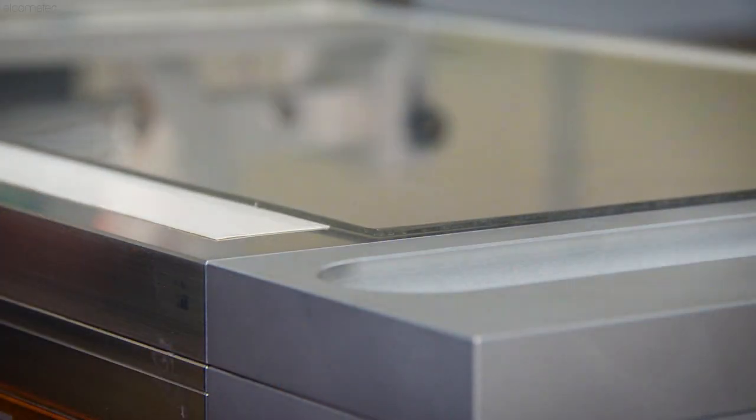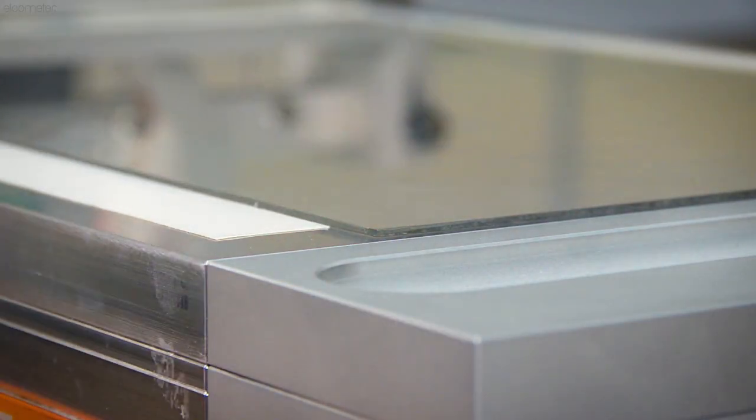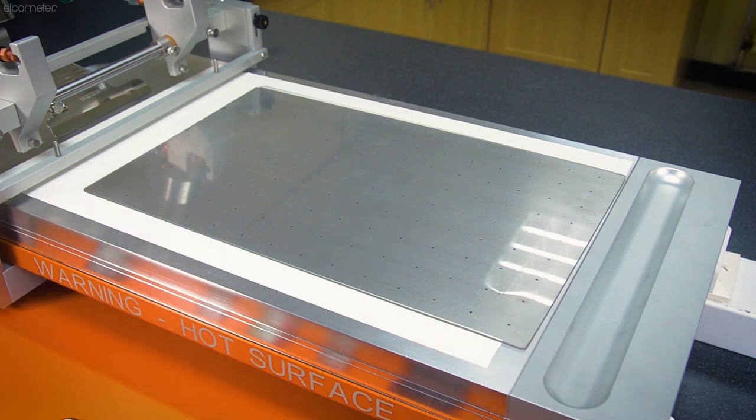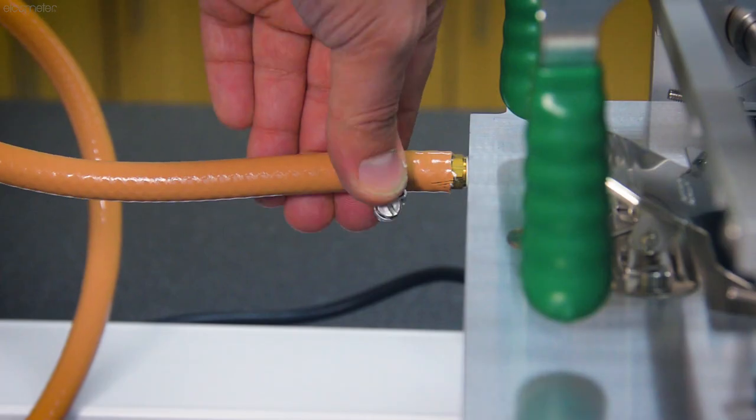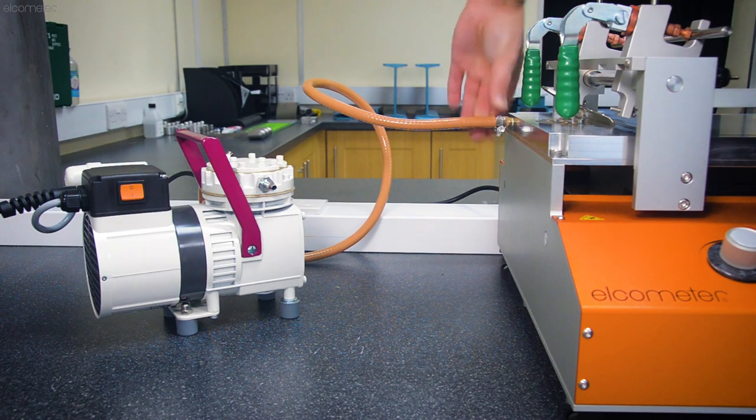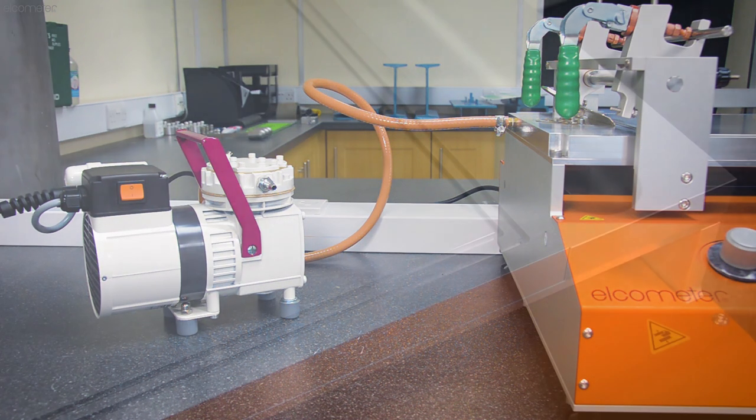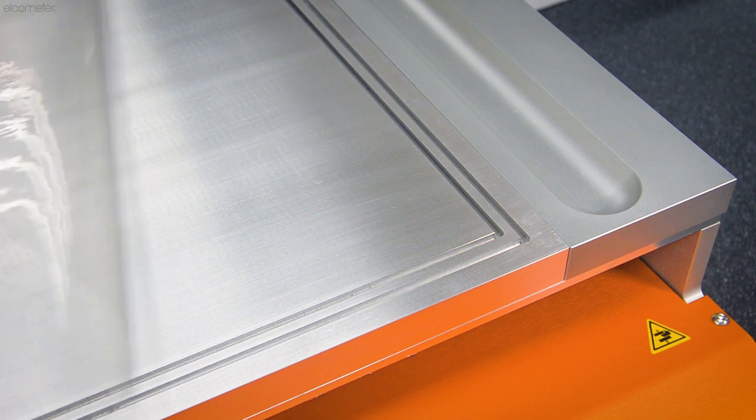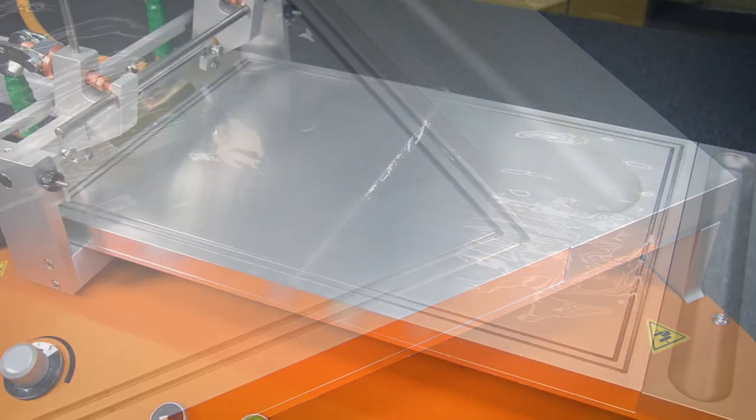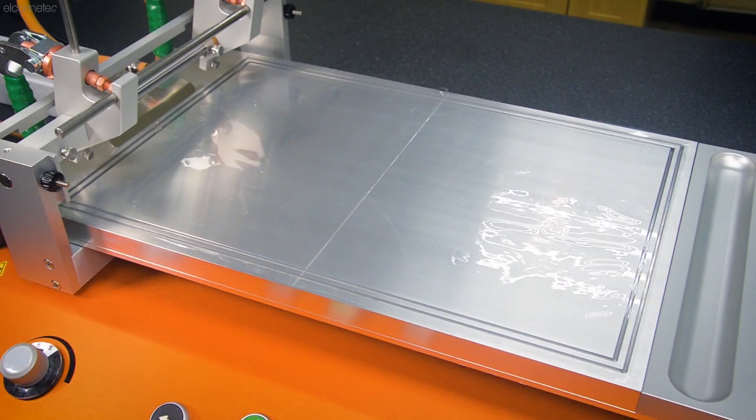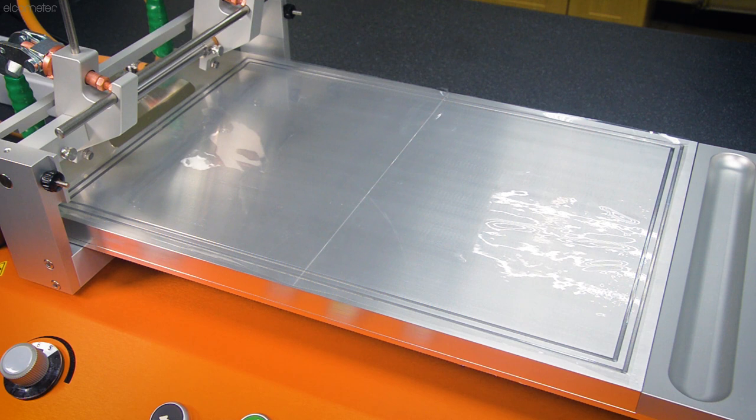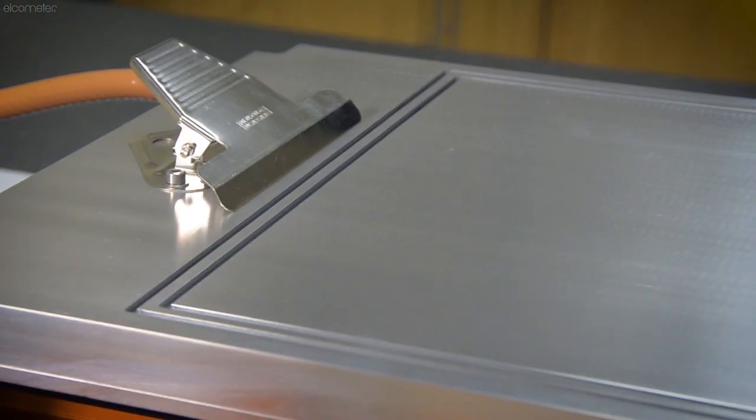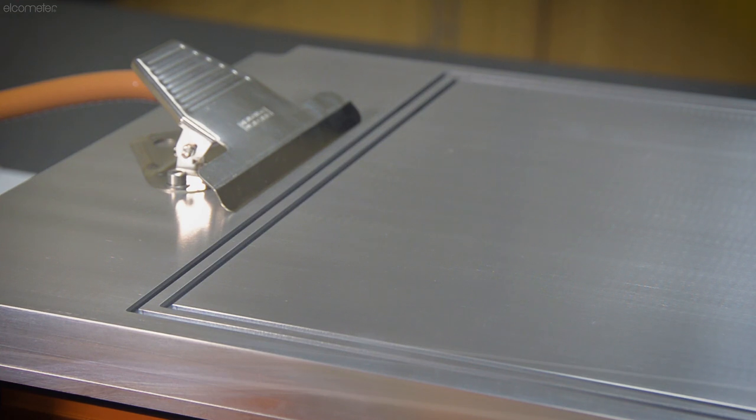When using a double channel vacuum table designed for thin substrates, the table is connected and started in the same way, but it only works with A3 sized substrates that completely cover the channels that run around the outside of the table. As the double channel table creates a vacuum from the edges rather than through perforations, this keeps the thin material flat and secure without creating irregularities.